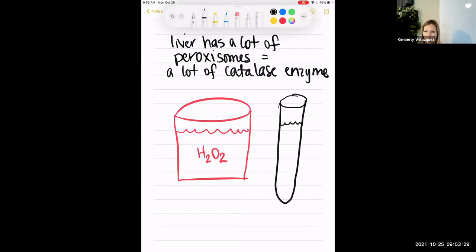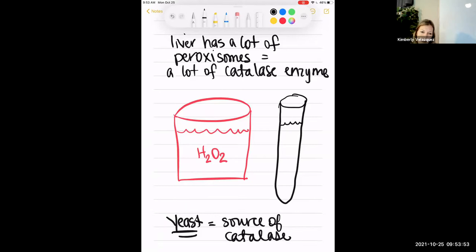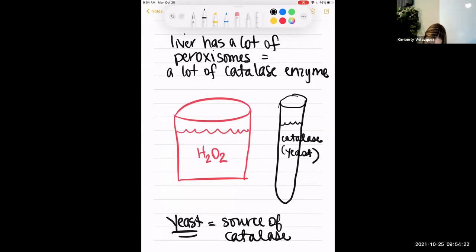For our home version, instead of cow liver we're using yeast as our source of catalase. Yeast are living organisms that carry out the same reaction. You'll have a medicine cup filled with hydrogen peroxide and test tubes containing different concentrations of catalase from yeast. You soak a little piece of filter paper in a test tube, then using forceps place it at the bottom of the hydrogen peroxide cup.